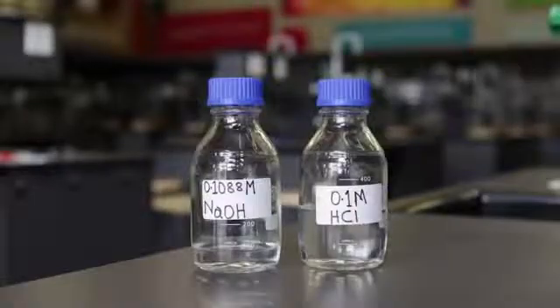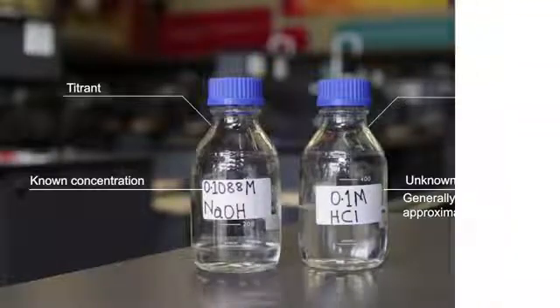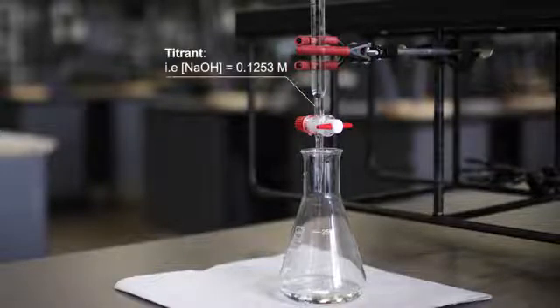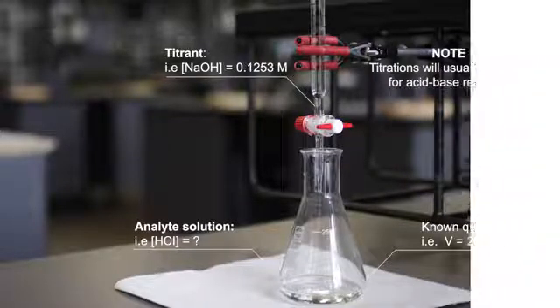What is a titration? A titration is a technique where a solution of a known concentration is used to determine the unknown concentration of a solution. Usually, the solution of known concentration or titrant is added from a burette to a known quantity of the analyte, the unknown solution, until the reaction is complete, which is indicated by the endpoint.